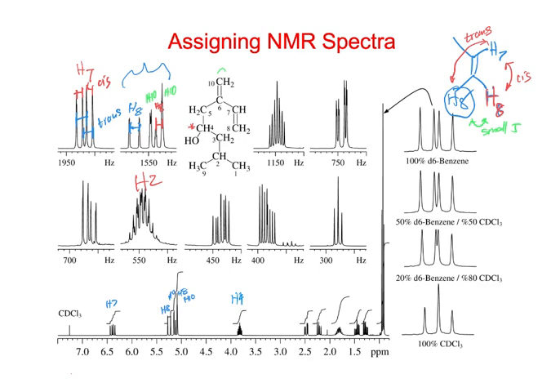Okay, so that's H4. And then notice down here, they kind of split these in a bad way. So notice that this is second order, leaning to the inside. This one is going to that side, this one is going like this, and this is going like this.